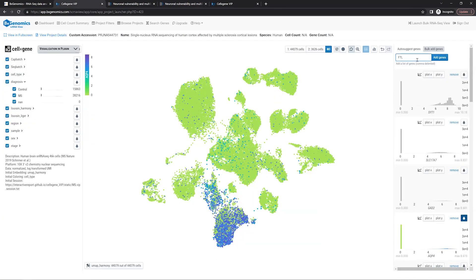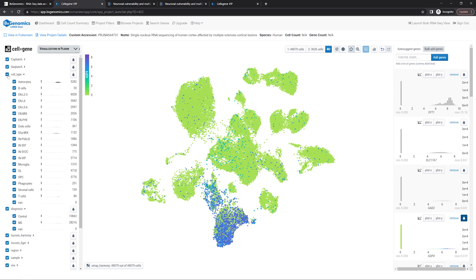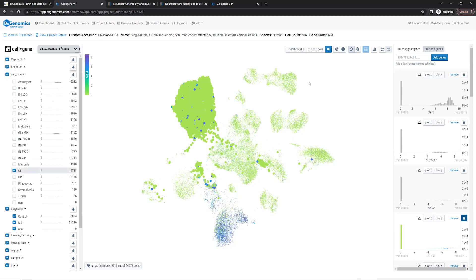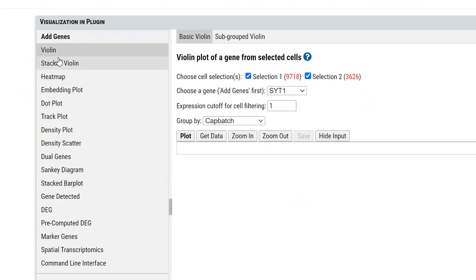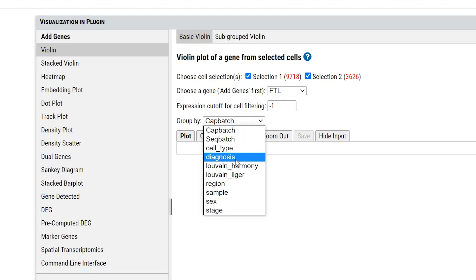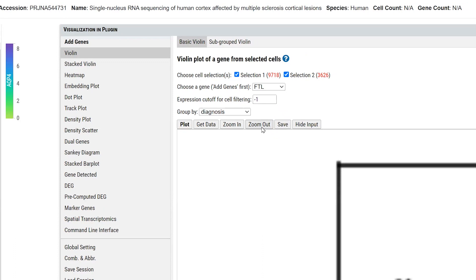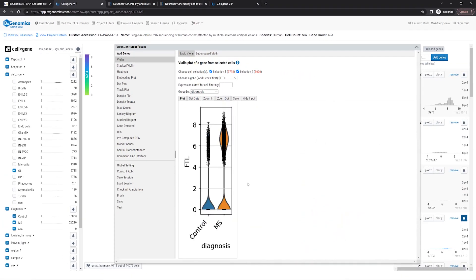First, we add FTL and FTH1 genes, and select only OL cells from the cell type annotation. In the VIP window, we'll choose Violin Plot, select FTL as the gene, use a cutoff of negative 1 to show all cells, and group the cells by diagnosis. Plot and adjust the zoom level, and it is clear FTL expression is much higher in multiple sclerosis than in control oligodendrocytes. The FTH1 Violin Plot shows a similar pattern.